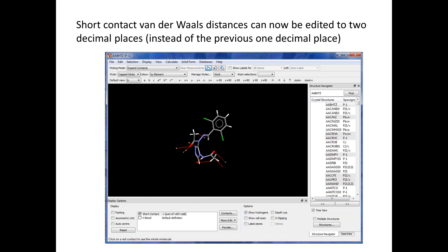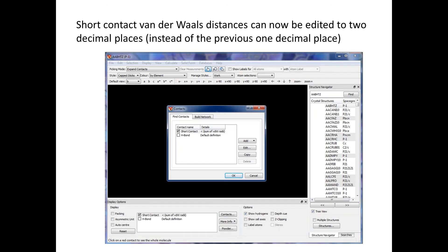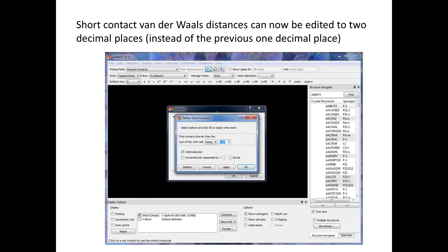We have also changed the way that the short contact van der Waals distances can be edited. Previously it was only to one decimal place, and now it is to two decimal places. Let's say that you have a molecule and you're expanding the contacts. If you go to edit the definition of the short contacts, you will now be able to input numbers up to two decimal places.